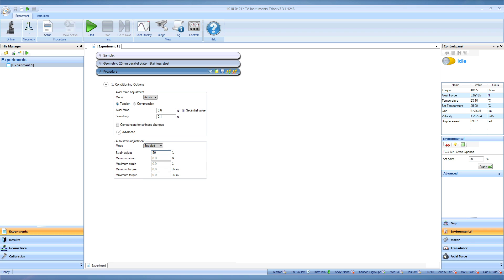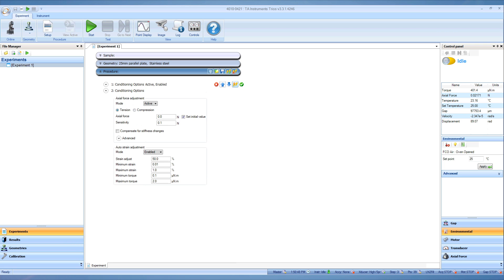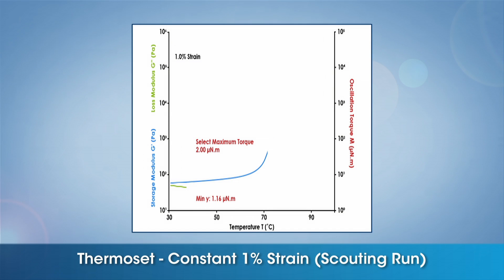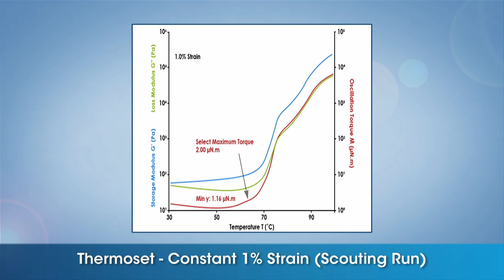Auto Strain is located in the Conditioning Options segment just below the Axial Force Control. Activate Auto Strain. The strain and torque settings are more accurately determined for each material by first running a scouting oscillation temperature ramp at constant frequency and strain. For this thermoset example, a temperature ramp was performed at constant strain of 1% with a frequency of 10 radians per second.